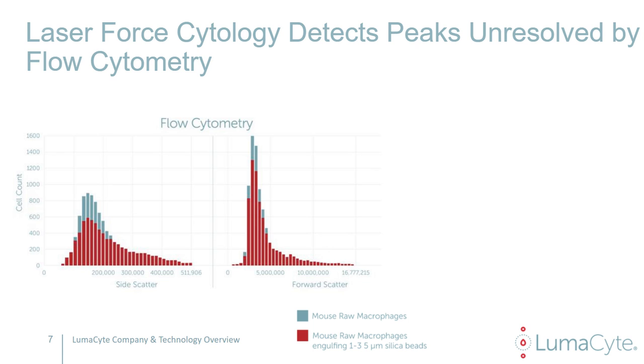So we get the question quite often, how are we different than flow cytometry? And we use flow, we use lasers. It seems quite similar, but they are fundamentally different technologies. And so an experiment we did several years ago highlights that very, very elegantly.